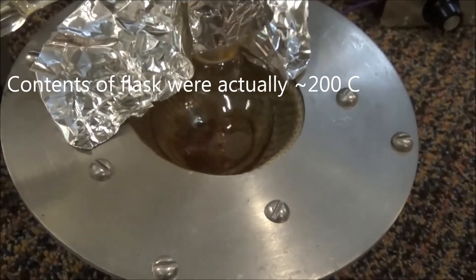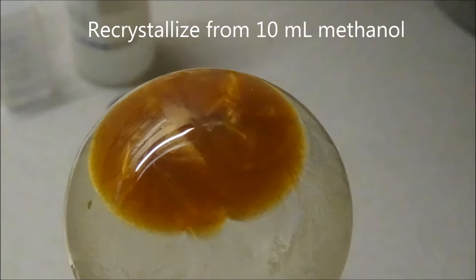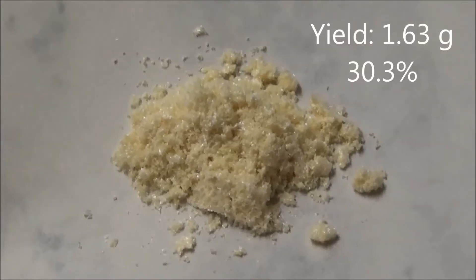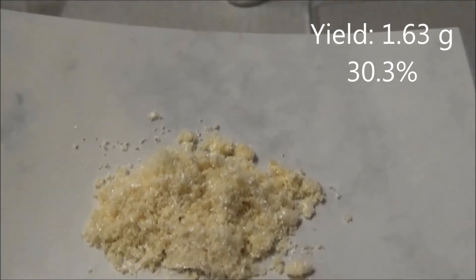I left the crystals here. For some reason the footage just disappeared, but I recrystallized the dirty brown solid in about 10 milliliters of methanol to give some lightly yellow, pure crystals of dibenzoyl methane. I got 1.63 grams, or a percent yield of 30.3%.